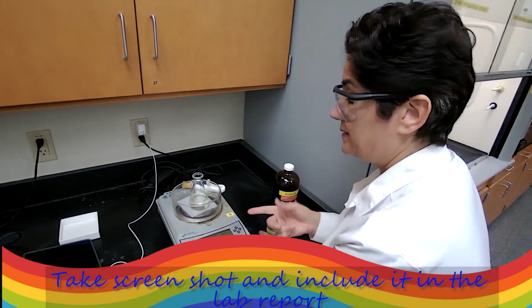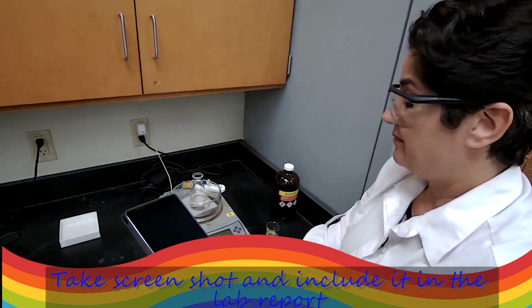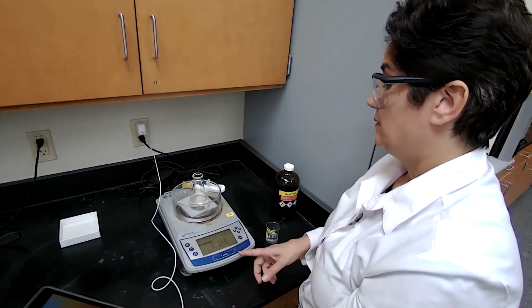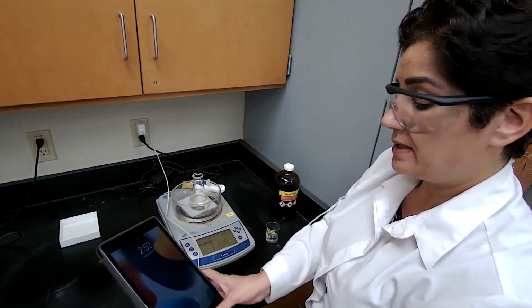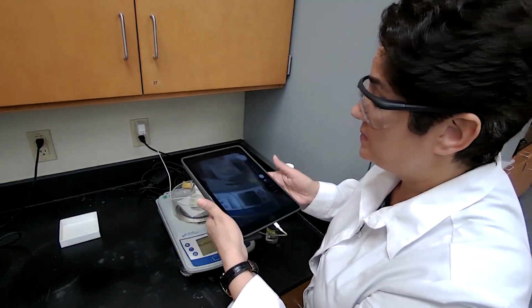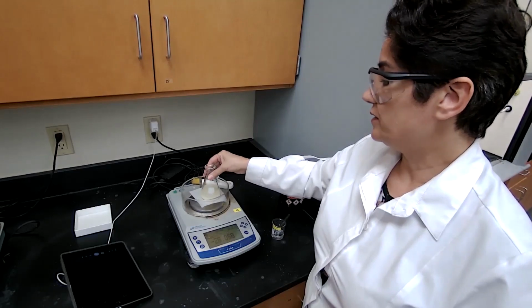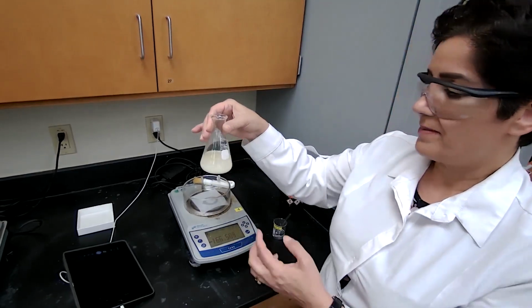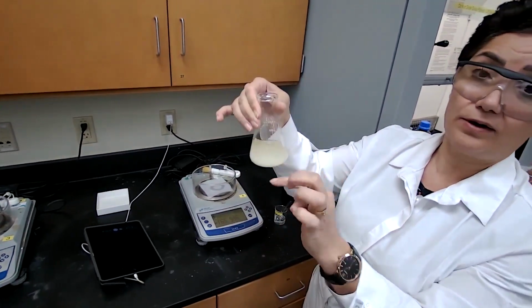Okay, I think this is the closest I could get to that number, and I have it as 1.211. A second, to take a picture as well for the record, recorded for the mass of the acetone, and the color is already changing.